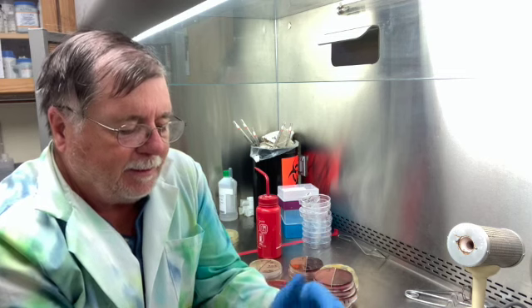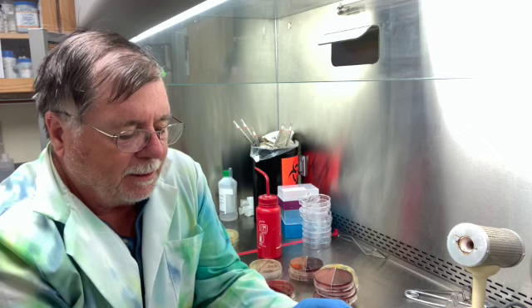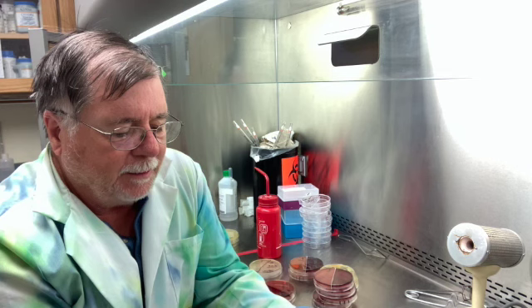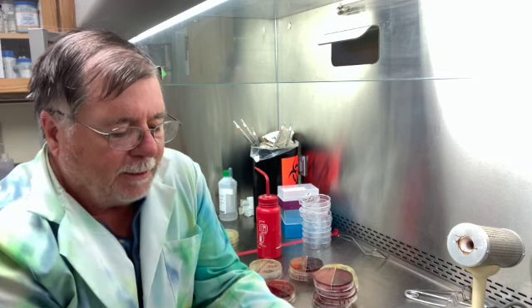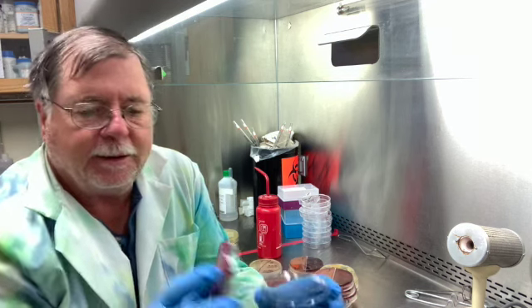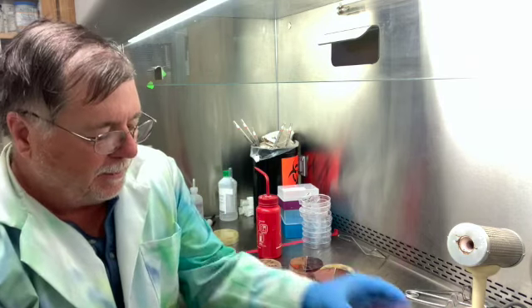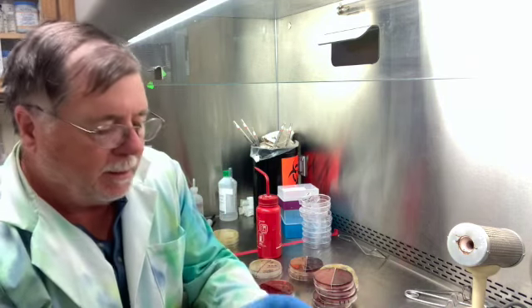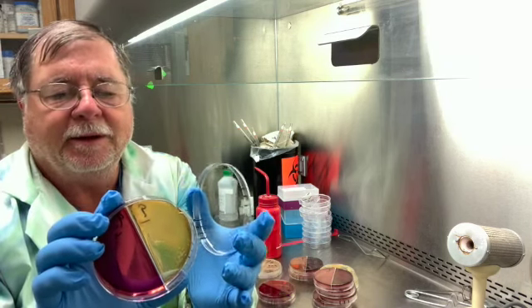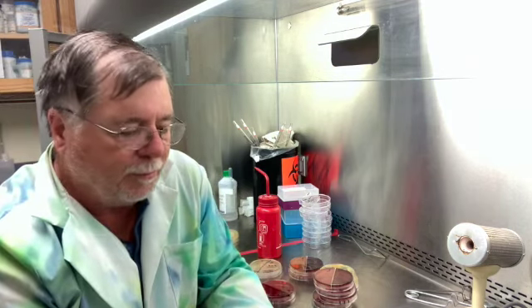And so that is eosin methylene blue agar and the coliform E. coli. And then the differential part is it differentiates between coliform and non-coliform. So here on this side, there are pink colonies. That means it's a coliform. And then this one here, the same type of media, those are not pink. That means it's a non-coliform. So it differentiated between coliform and non-coliform.